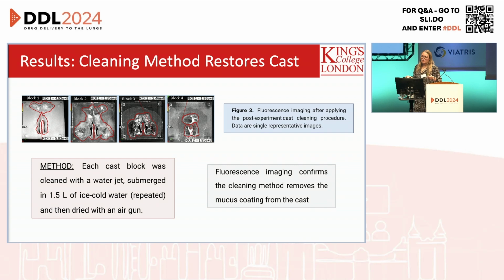So a bit about washing the cast. We wanted to make sure that after each experiment that we conducted, the cast was washed properly. There was no mucus left in the cast.